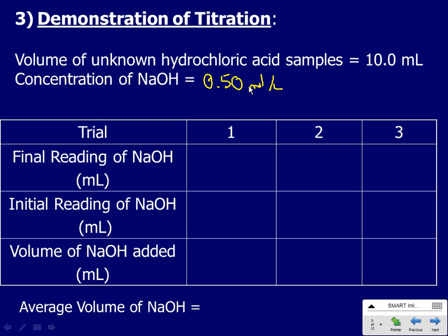We can put that back into what we call the burette clamp. It just works like that. All right, you'll need it about that high. So we've cleaned the burette. Now we're going to load it.